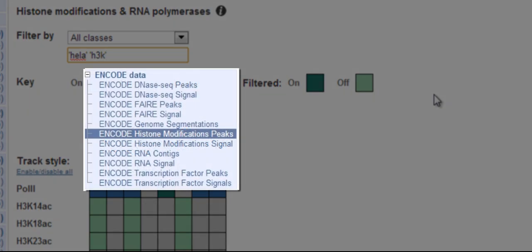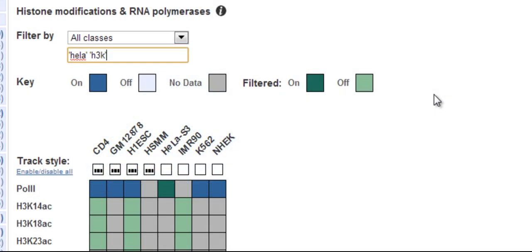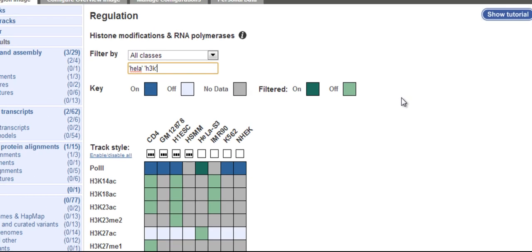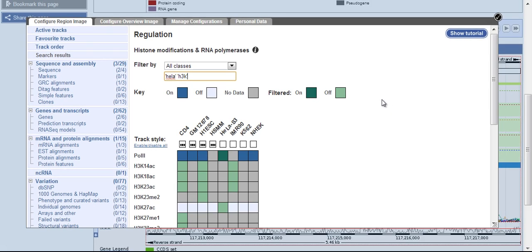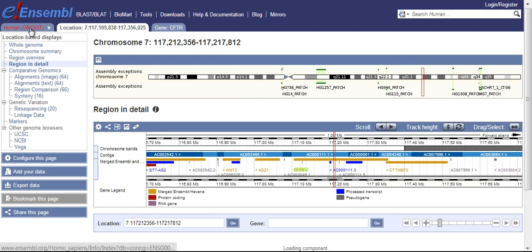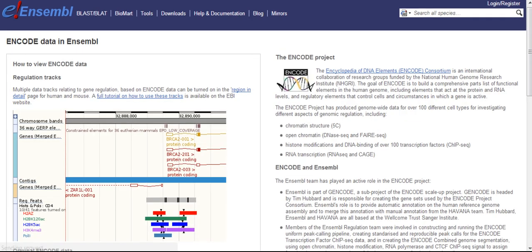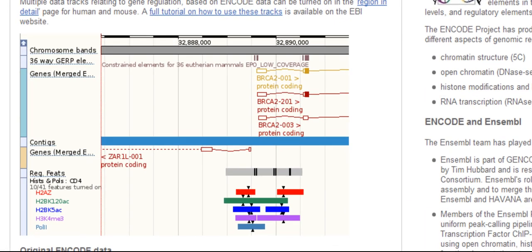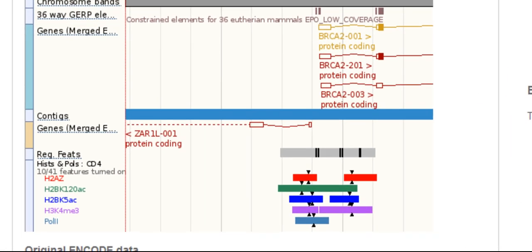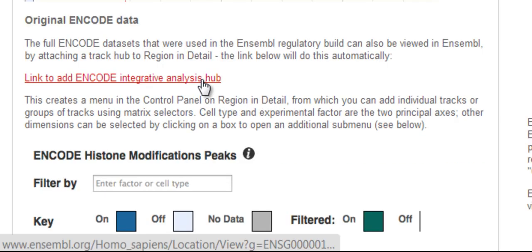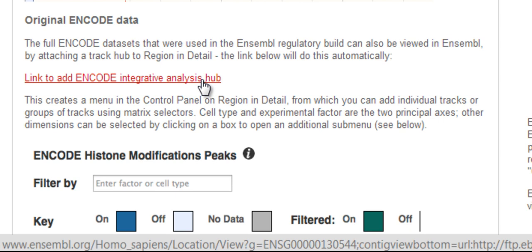Our ENCODE track hub, which allows display of all ENCODE data, works with these same type of matrices. To add the track hub, the easiest way is through the ENCODE page on our website. Go to the home page, click the ENCODE icon, and then follow the link to the track hub. Since it's a lot of data, it really slows the configuration page down, so don't worry if it takes time to load.